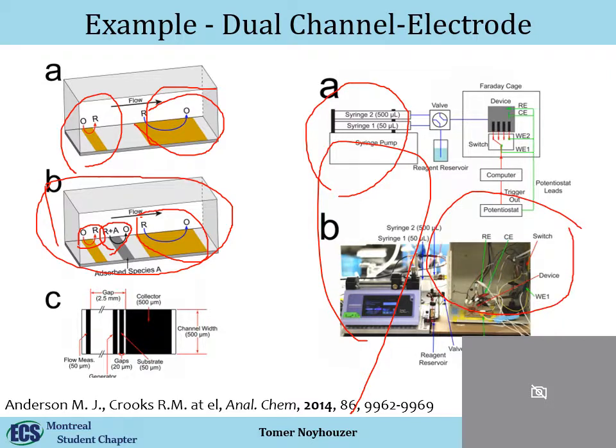Look at all the wires and all the things coming out of the system. It's really, really messy. But you need to remember, experimental systems are often messy, right? We're trying things, we don't know if it works, we'll change things, and then it works, and then we don't want to touch it, we want to run it, get all the results. It's the job of a product designer to take our messy job and, talking with us, try to figure out the way that we can make a nice system that is user-friendly.